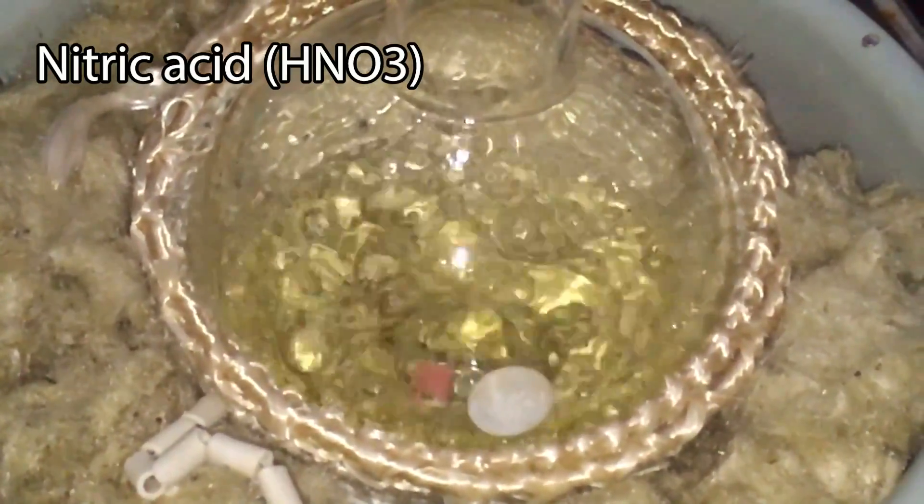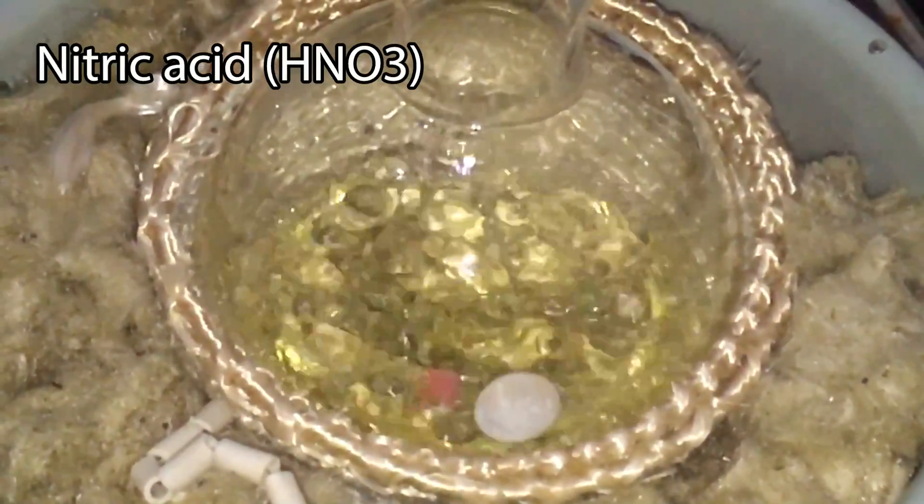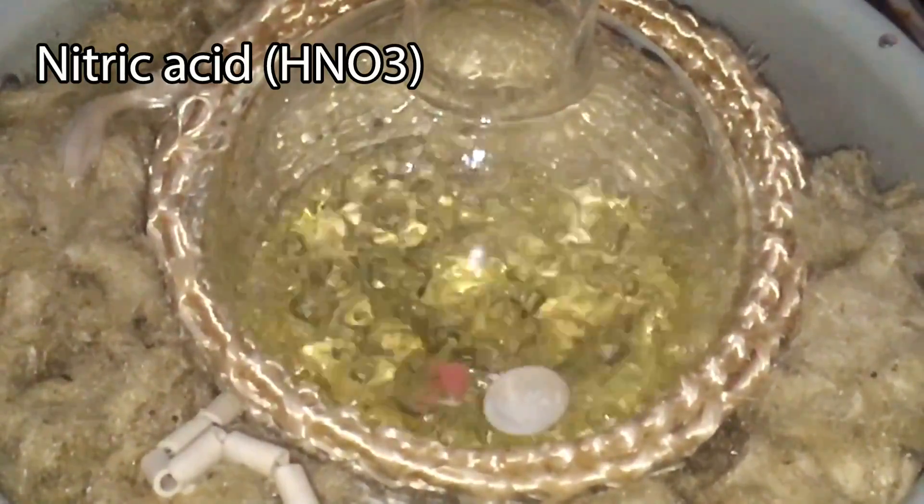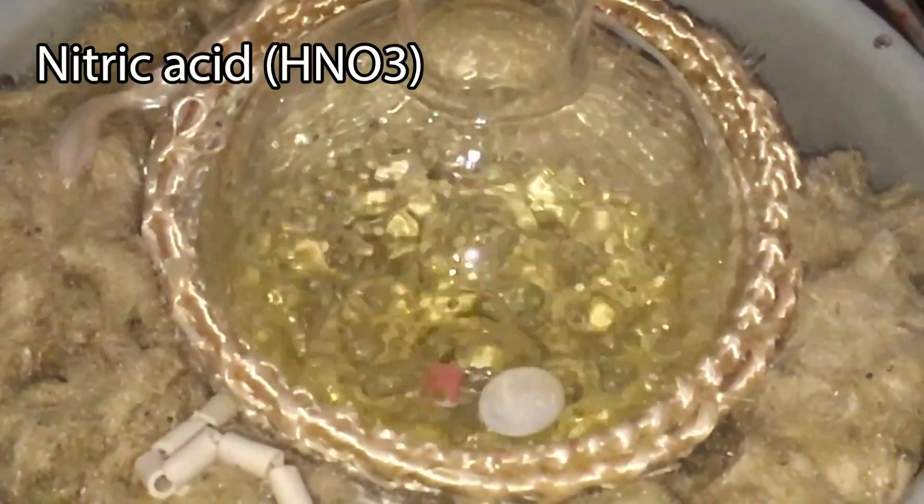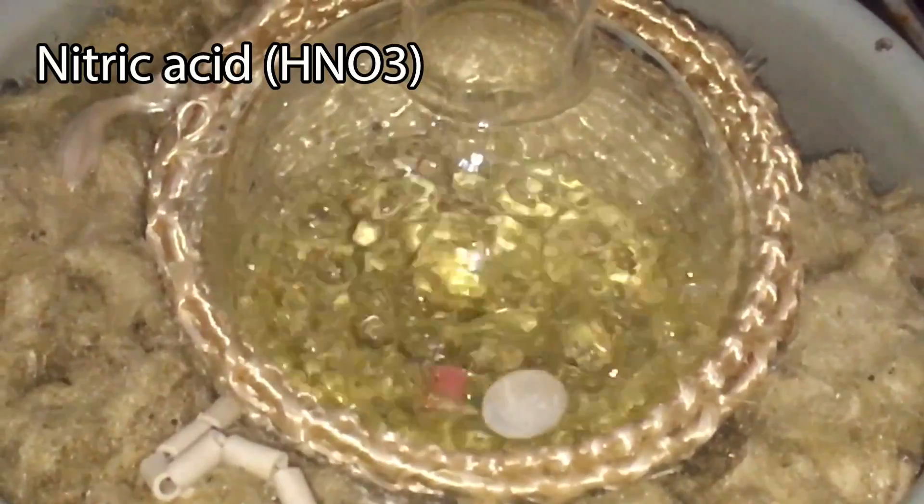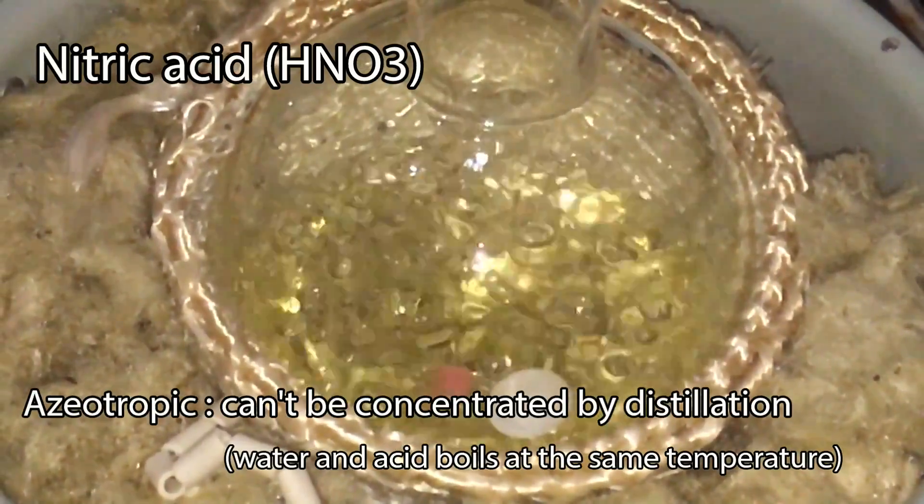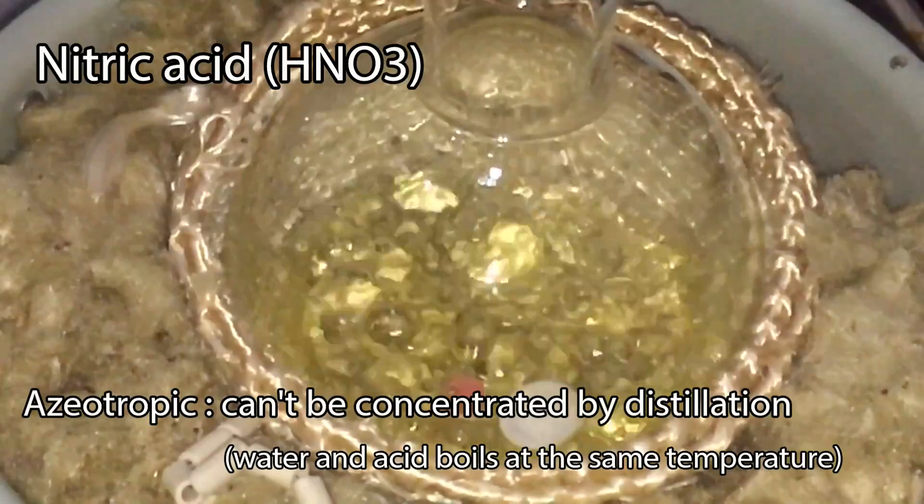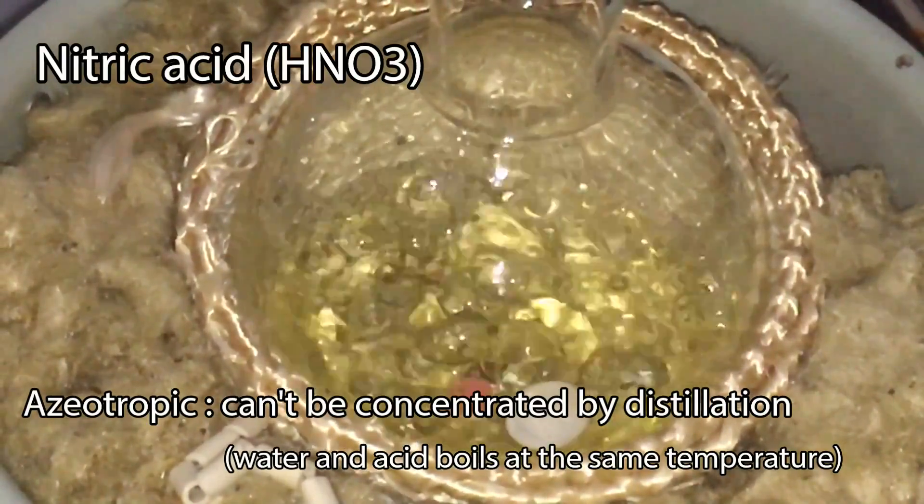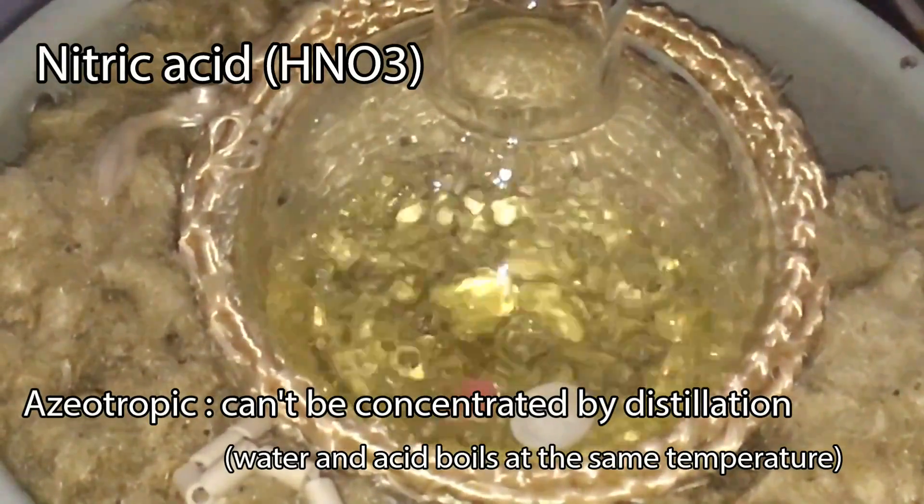The nitric acid we are going to make today is the azeotropic one, which means you cannot increase its concentration any more by distillation. I will show you how to make 100% nitric acid in a future video. With that being said, let's move on to the ingredients.